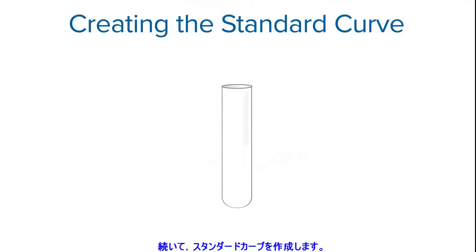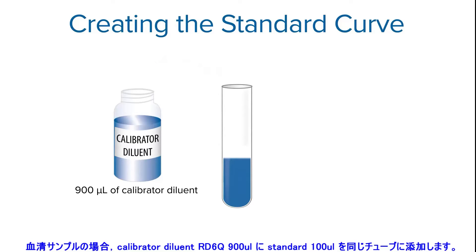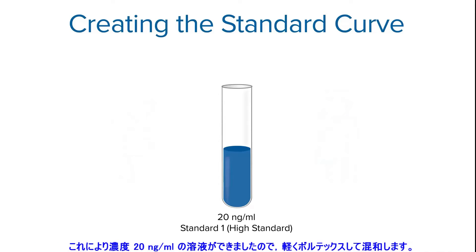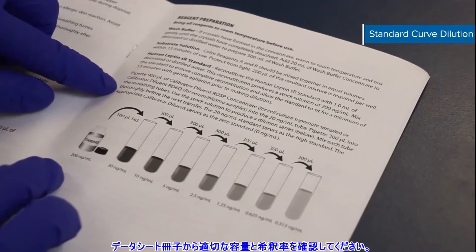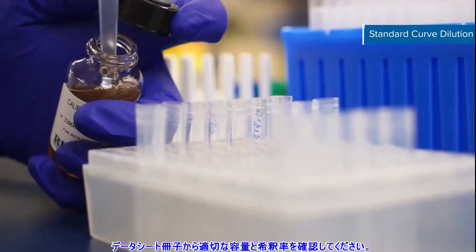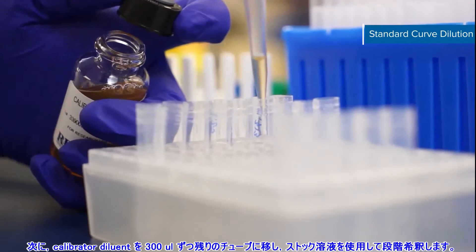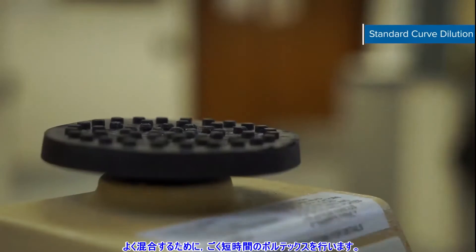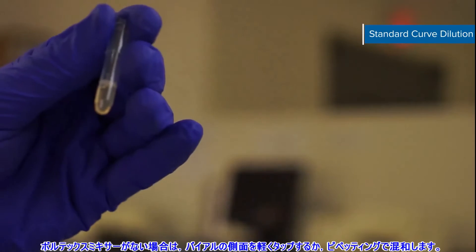It's time to create the standard curve. For serum samples, pipette 900 microliters of calibrator diluent RD6Q into the 20 nanogram per milliliter tube. Then pipette 100 microliters of the standard into the same tube. This creates a solution with a concentration of 20 nanograms per milliliter. Vortex gently to mix. Check your kit booklet to ensure you have the right volume and diluent. Next, pipette 300 microliters of the appropriate calibrator diluent into the remaining tubes. Use the stock solution to produce a dilution series and be sure to mix each tube thoroughly by very briefly vortexing. If you don't have a vortexer, you can lightly tap the side of the vial or pipette up and down.